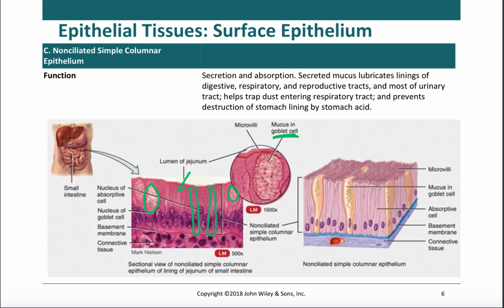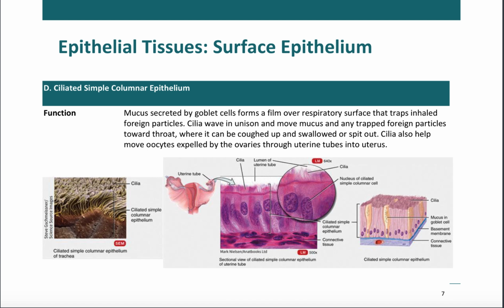They're not considered ciliated. Ciliated refers to having long hairs. They may have very small hairs, but those hairs are often not fully visible. There would be maybe a light fuzzy layer on the top, but it's not truly all that visible under a microscope. But this is a classic example of simple columnar cells.